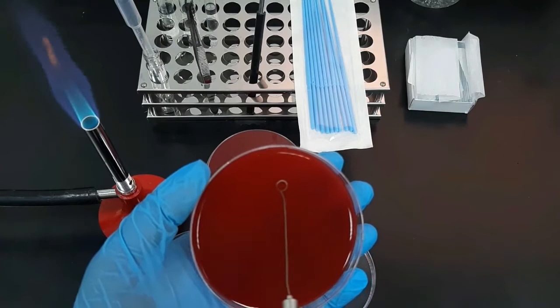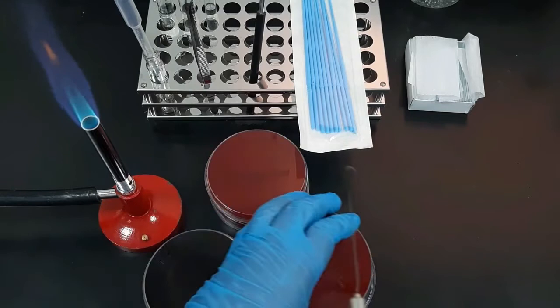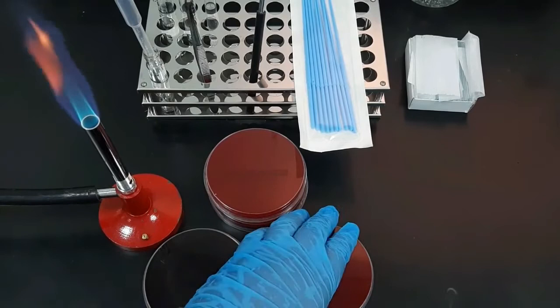Once the wire loop is cooled, make four to five streaks in the third quadrant area by pulling out from quadrant two without overlapping the previous streaks. Close the plate and again heat the loop and repeat the streaking in the fourth quadrant of the plate.